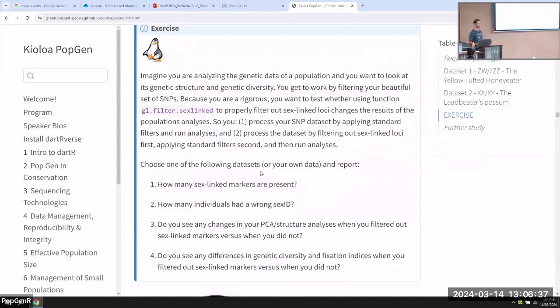And then basically from here, we have an hour left. So if you have your own data, load it up into the cloud. So get your metadata file, get your DArT CSV file, or any other sequencing file you've used, load it up in the cloud, and read your data in using the GL read DArT function. Don't do any filtering, and run this.